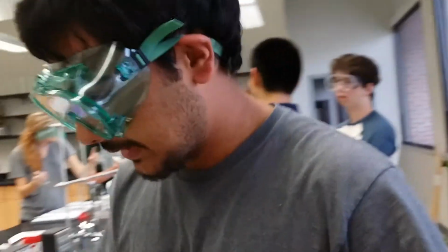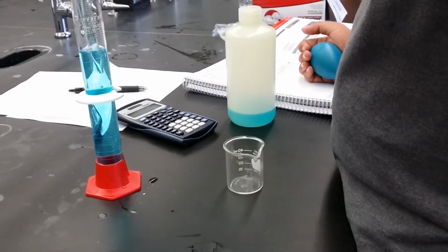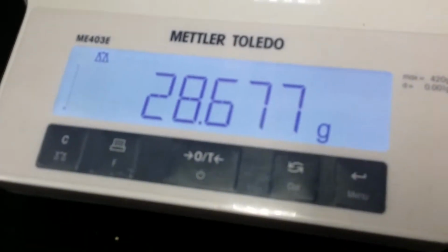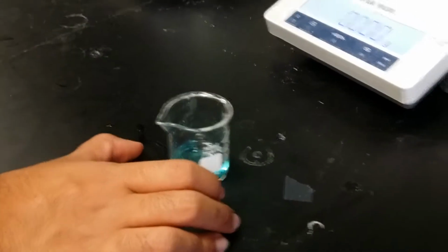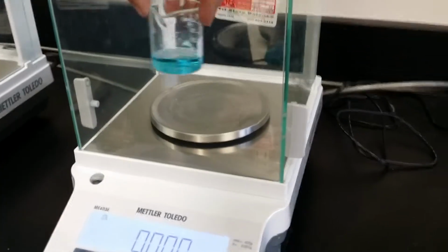Guys, okay, so I'm going to do the final one. So we're going to take out 10 ml, right? There is 10 ml exactly. So we got to go weigh the beaker first. It's 28.677. Now, this is going to take a while, so we're going to cut a bit. Alright, so that's 10 ml right there. Okay, now we're going to weigh this.